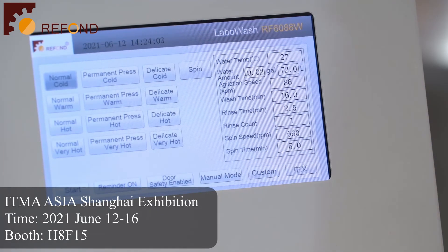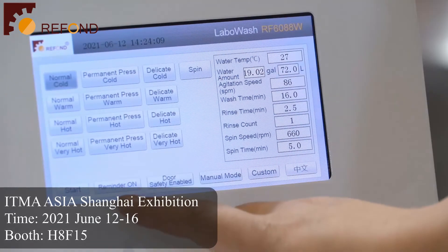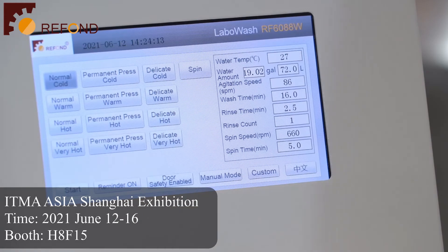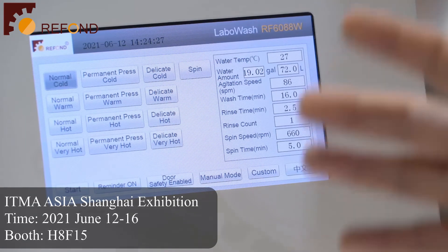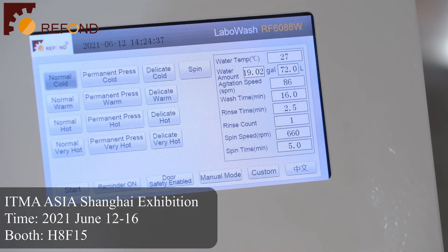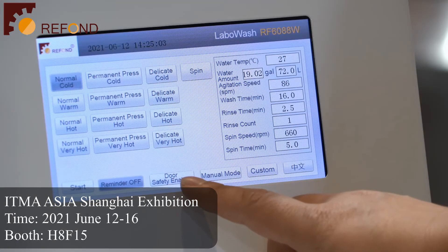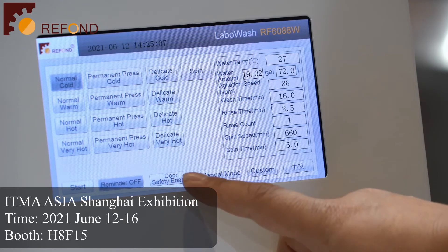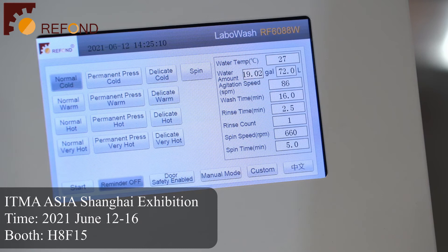Besides all these functions, our LaboWash machine also has additional reminder information. The reminder is for prompting the customer to add the washing load — the testing specimens. Once the water level reaches the desired level, the machine will remind you to add the specimens or detergent. Another function is the safety door switch: when enabled, if you open the door while the machine is running, the motor will stop. This is the safety function.